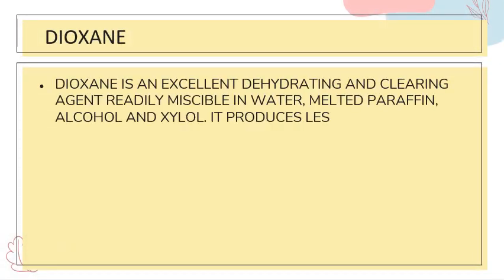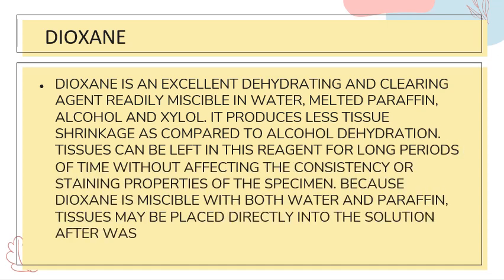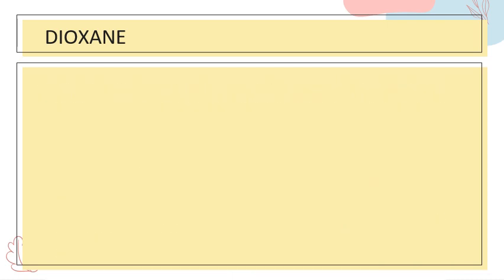So dioxane is an excellent dehydrating agent and clearing agent, readily miscible in water, melted paraffin, alcohol, and xylol. It produces less tissue shrinkage as compared to alcohol dehydration. Tissues can be left in this reagent for long periods of time, unlike acetone, without affecting the consistency or staining properties of the specimen. Because dioxane is miscible with both water and paraffin, tissues may be placed directly into the solution after washing out. However, tissue sections dehydrated with dioxane tend to ribbon poorly.